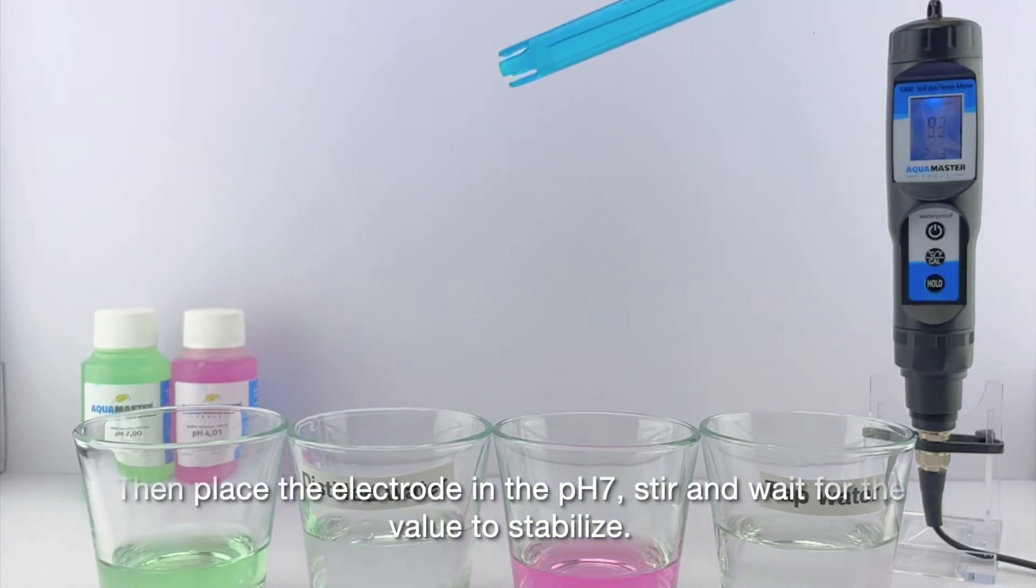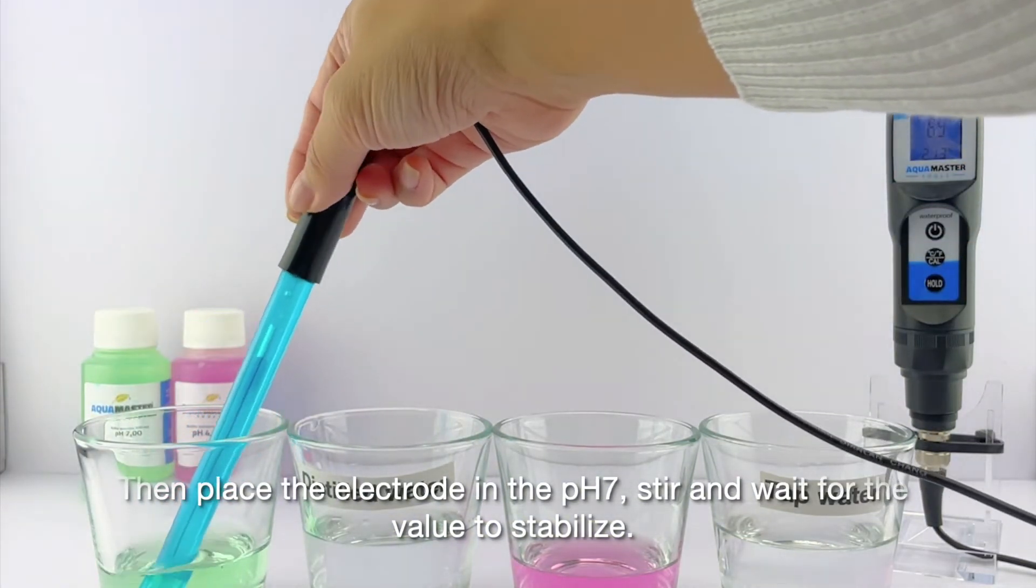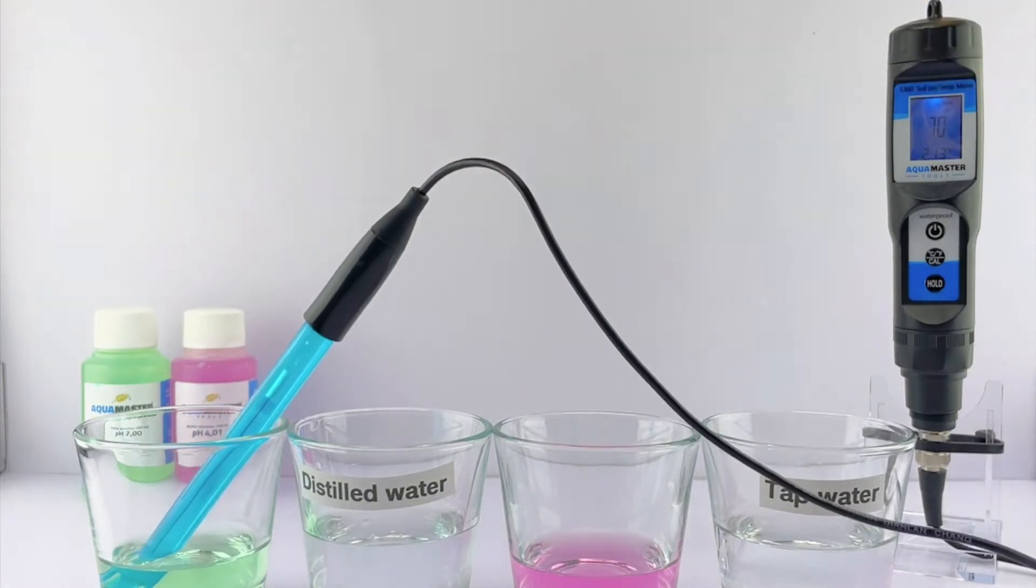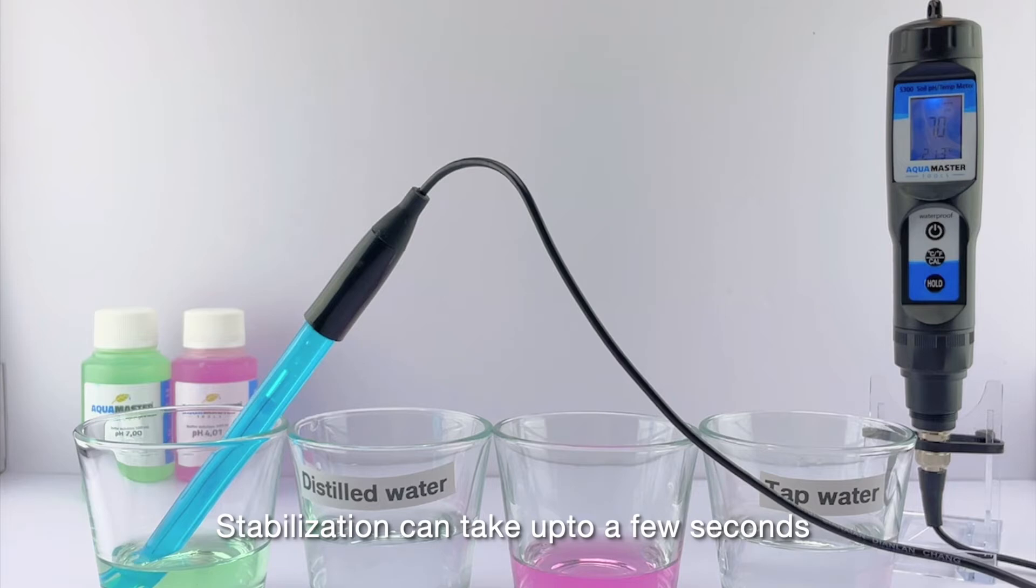Then place the electrode in the pH 7, stir and wait for the value to stabilize. Stabilization can take up to a few seconds.